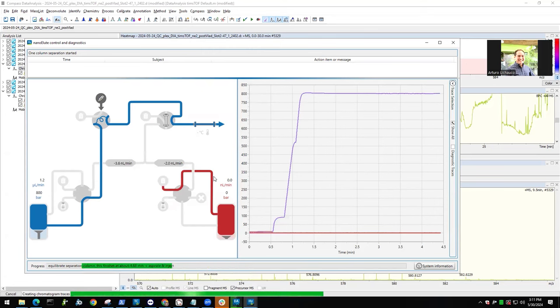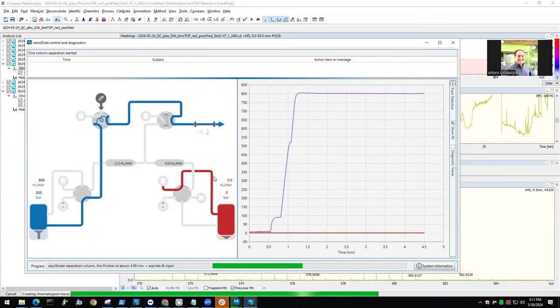It actually penetrates. See, there is now a hole in position 3.